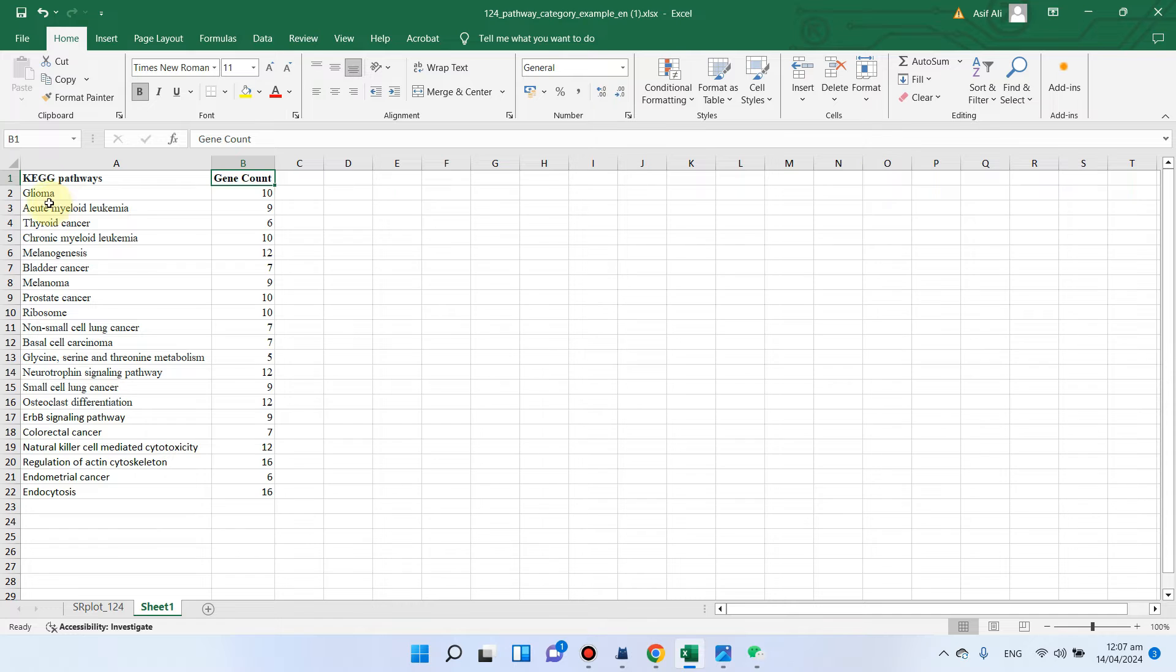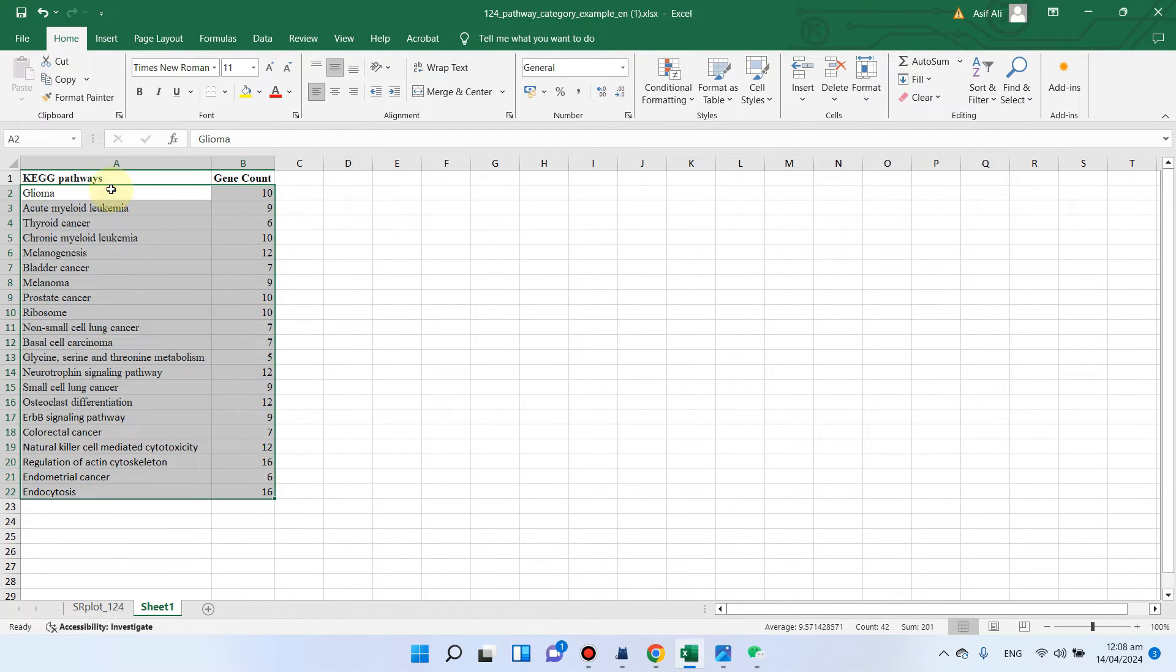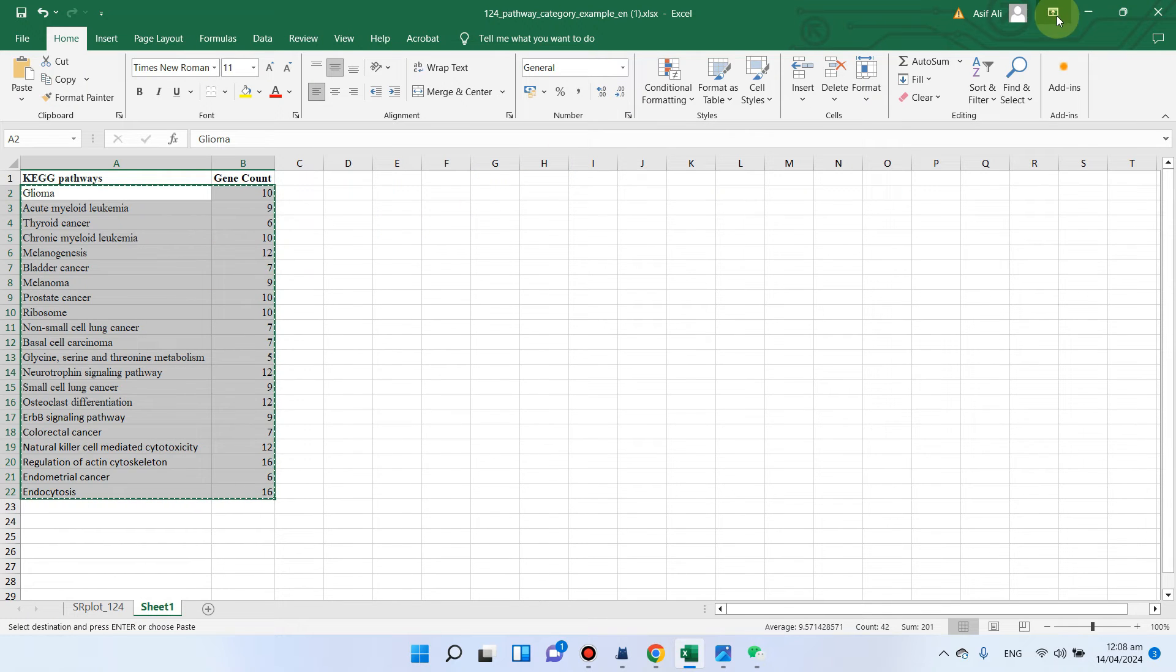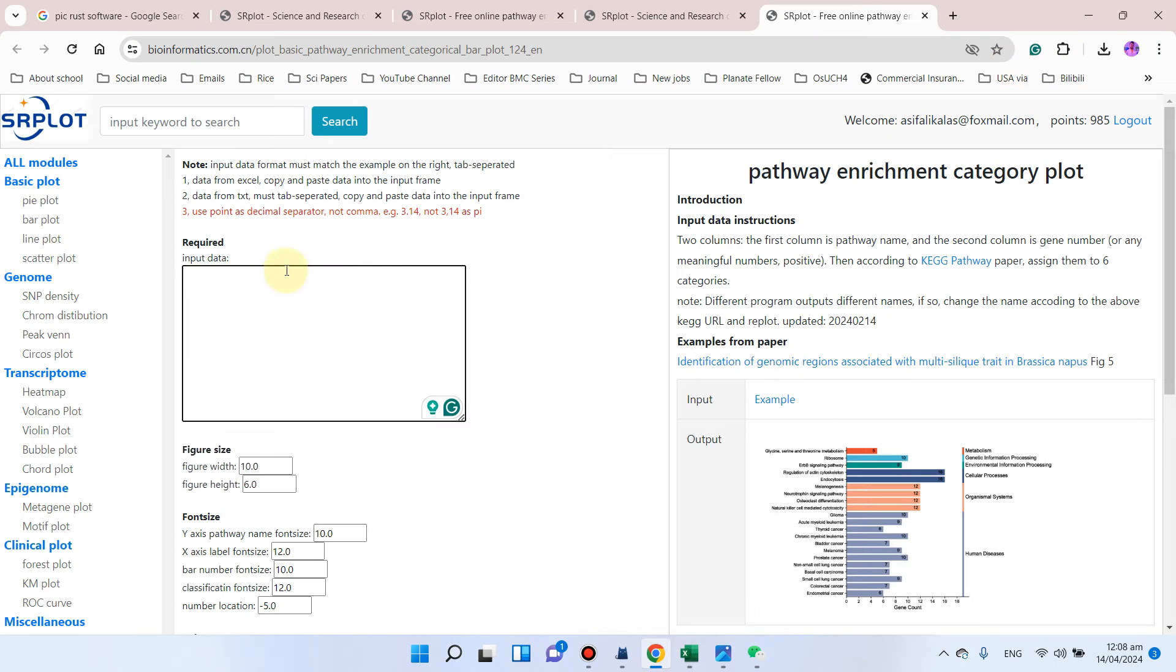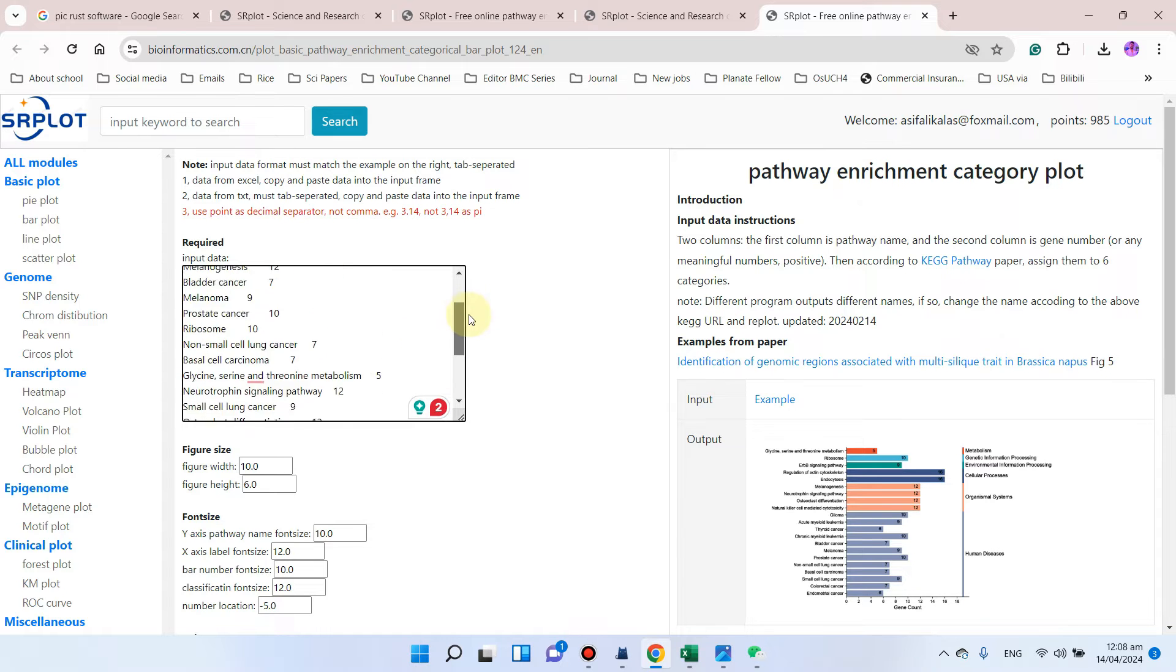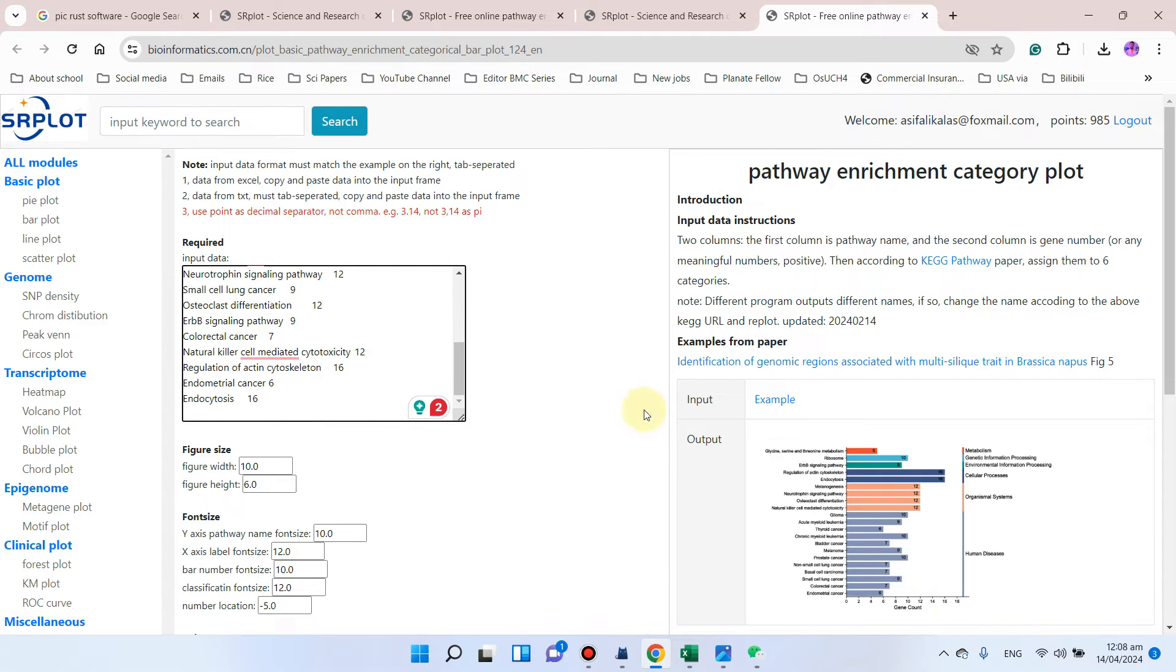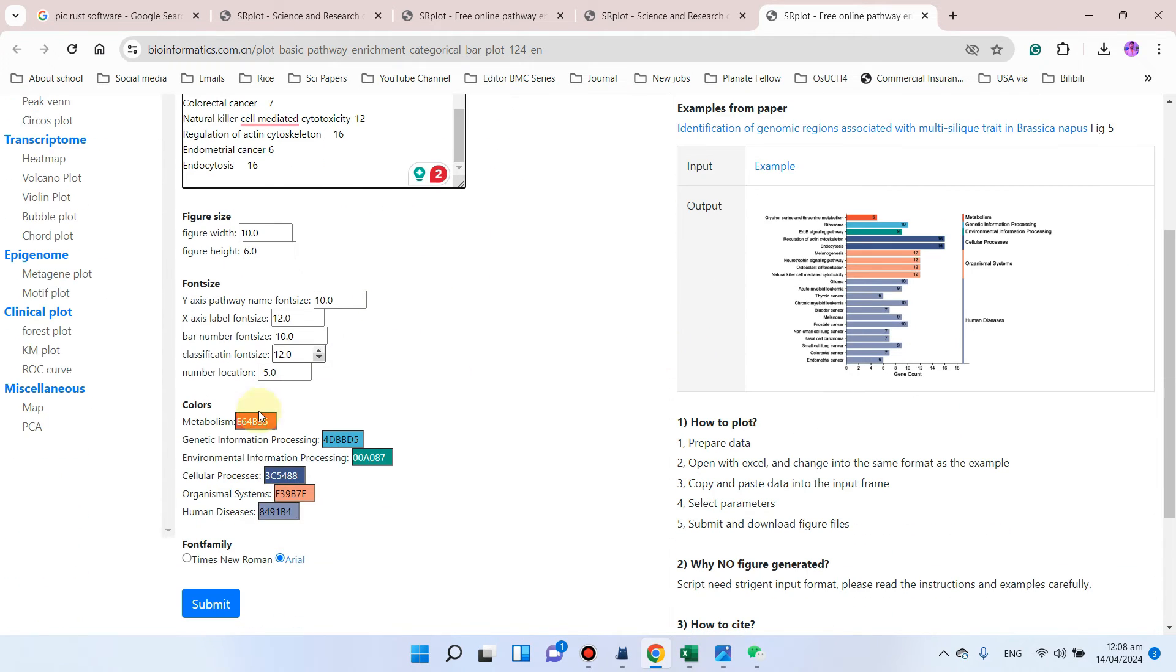We can copy all these KEGG pathway names and gene counts without their header, and we can simply copy this information and paste it into this data box. We can simply select different colors for these pathway names.